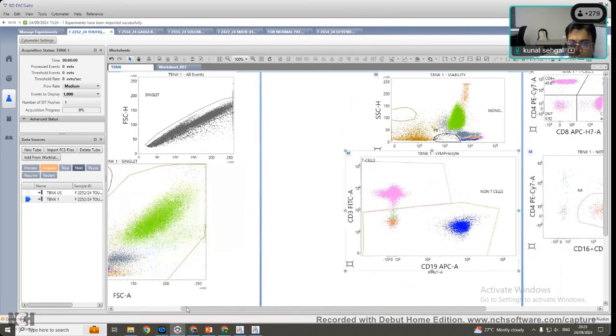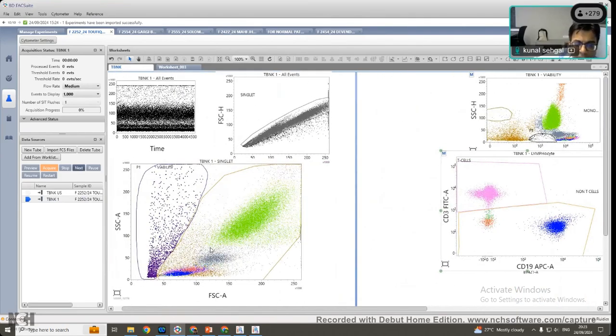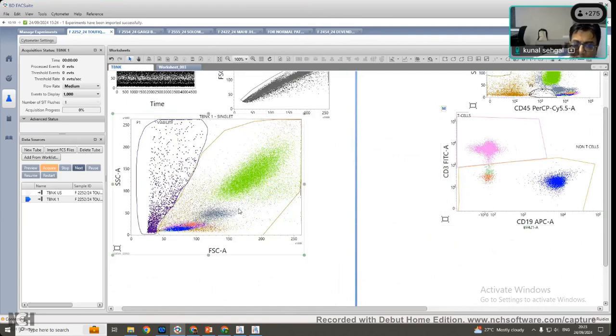Okay. So in life, if you want to measure elephants and ants on the same scale, can you measure them on the same ruler? If you want to measure their width or height, you cannot, right? But if you want to measure different types of ant and maybe a cockroach, you will say, okay, this ant and cockroach you can measure on the same scale. Same way, when we measure populations, we need two types of scales. One is called the linear scale.